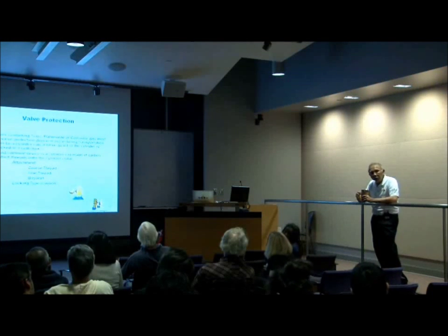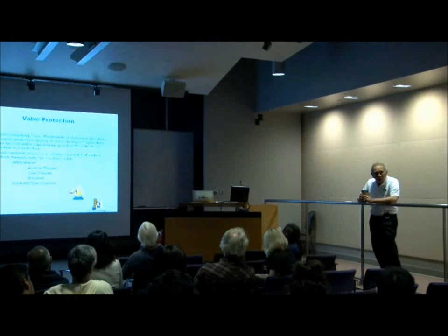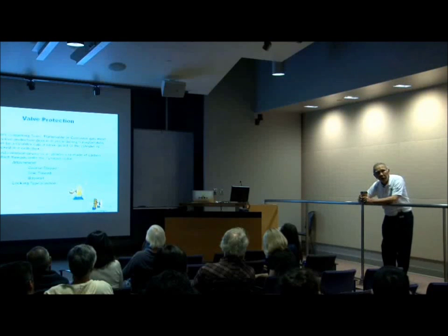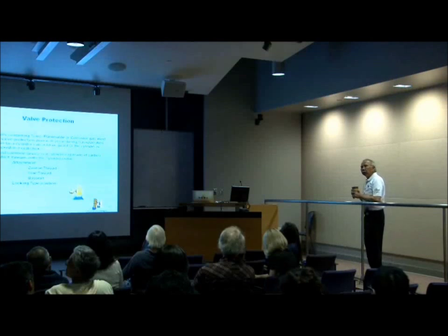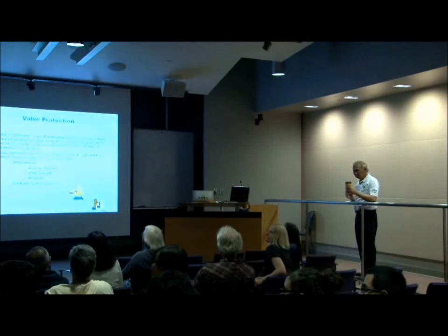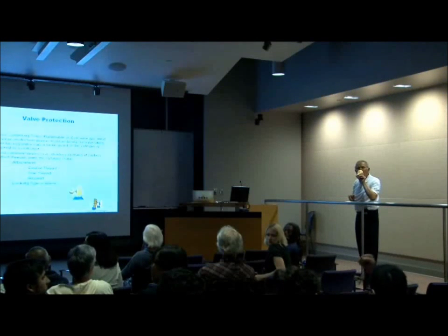You can't refill it. Is that a common regulation in industry? It's a transportation regulation. In fact, some countries are even stricter. Some countries have a 3-year retest requirement. So it depends on the specification of the cylinder. Yeah, the hydrostatic test date is interesting. It's hard for people to see, and frankly, if you don't know it's there, you'll never look for it. But it should be stamped on the top of the cylinder.